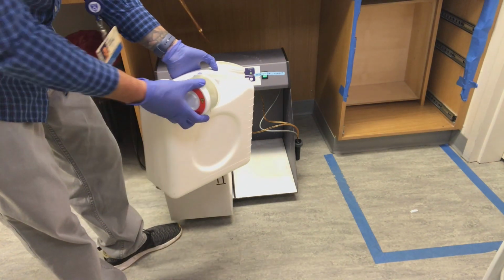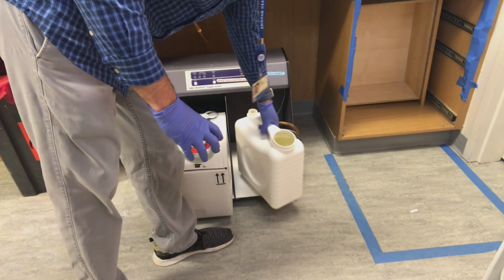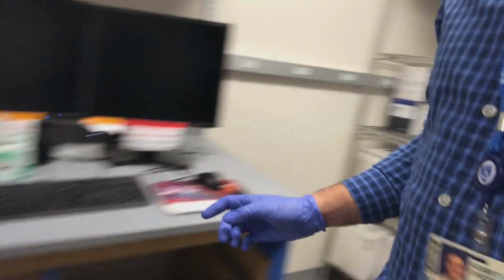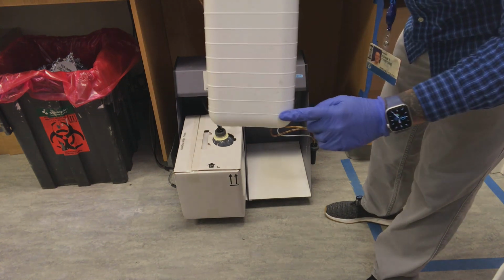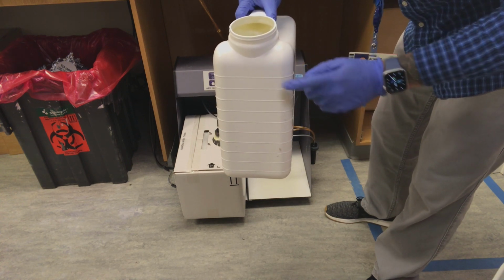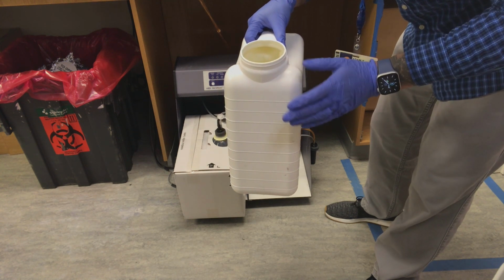When you're ready to reinstall the waste tank, you can find bleach here. And go ahead and fill the tank to this first line so that in the event this were to fill, the resulting solution would be at 10% bleach and inactivate any live cells.